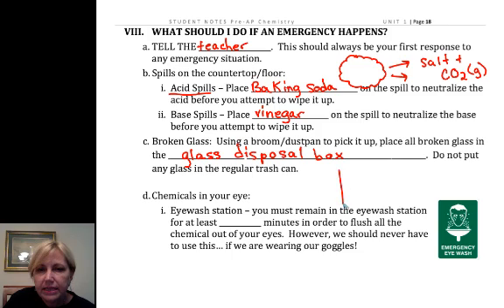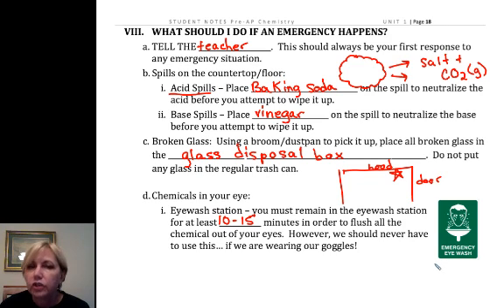The eyewash is in the back of our room. If you look in the back, this is the back door, and the hood is right here. Right next to the hood is the eyewash. You want to be able to find the eyewash with your eyes closed, because if you need an eyewash, you probably have to keep your eyes closed. You need to wash your eyes for 10 to 15 minutes. Get yourself over there or get your partner to the eyewash, but call me over loudly so I can come and help. The eyewash is also good for flushing your arm or your face if you get a chemical on either one.